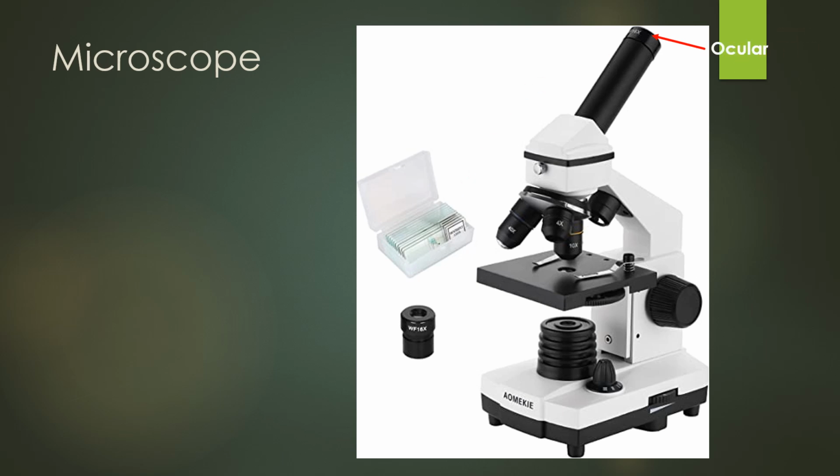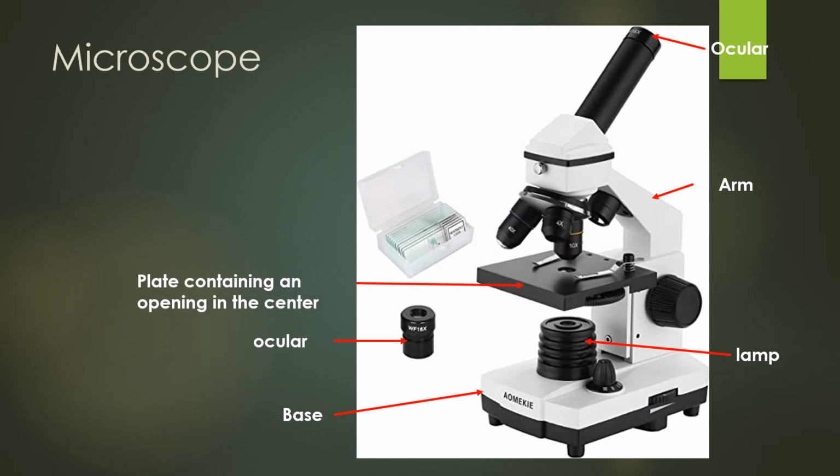This is the ocular. This is the arm. This is the lamp. This is the base. This is the plate containing an opening in the center.